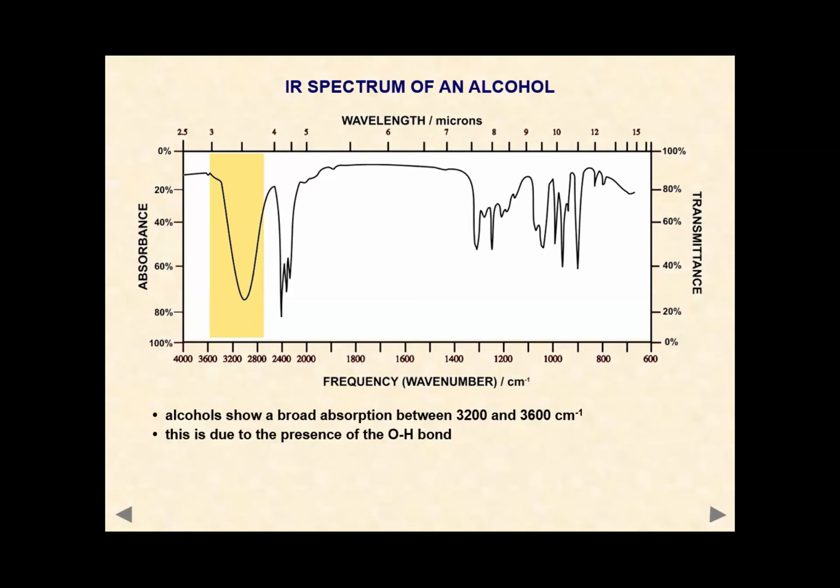One peak is at 1760 or 1750, that is for C double bond O. And on the same spectrum, we are going to get a peak at 3200 per centimeter, which shows the presence of OH, because carboxylic acid is going to have a carbonyl group and an alcoholic group. So we are going to get two distinctive peaks in the infrared spectrum. Is it clear? Good.